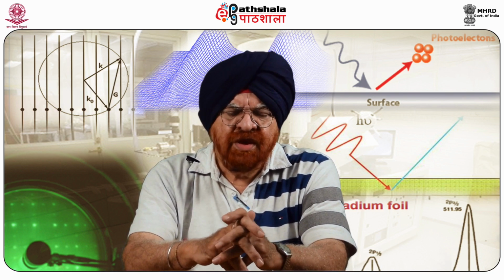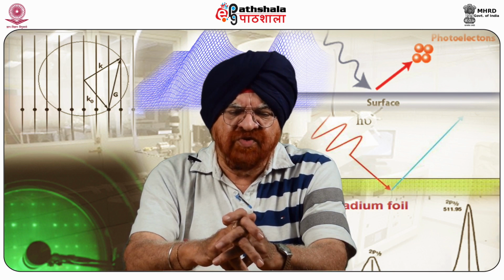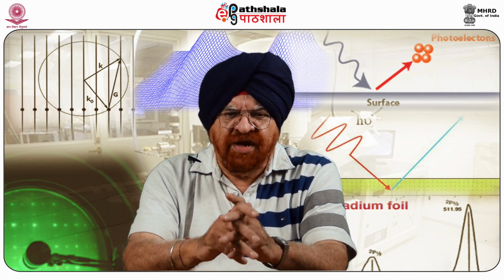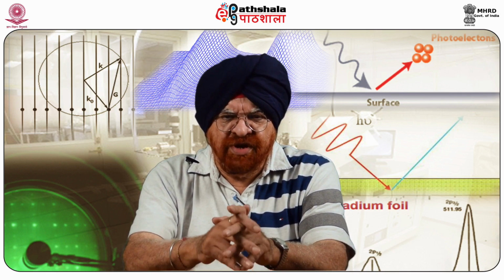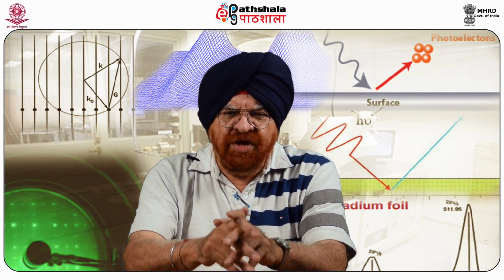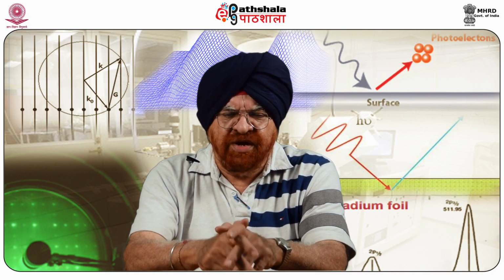The local bonding environment of a species in question is affected by a number of factors. The first one is its formal oxidation state. The identity of its nearest neighbor atom can be measured when we look at the oxidation states of a particular metal in a material. Then its bonding hybridization to that nearest neighbor atom.